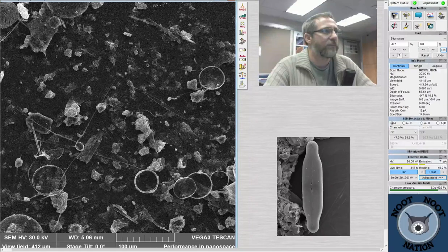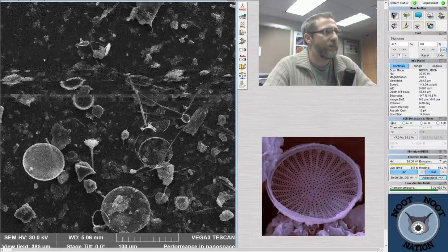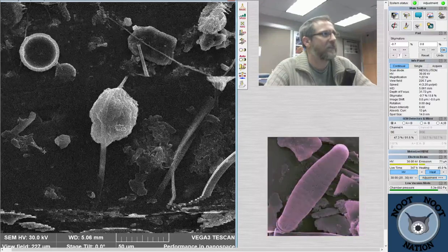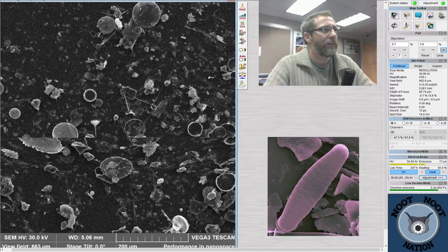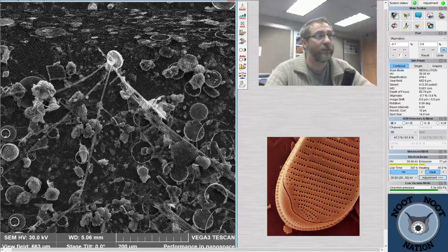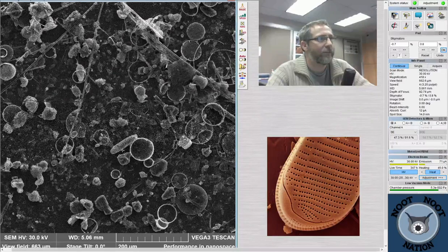So it's encouraging because it tells me there's probably a bunch of skeletonema in here. A piece of junk with a bit of a girdle band on it. It means we just need to look a little bit for something at that scale, and maybe we can find some without the girdle band on it. That would be a nice thing to finish up our imaging with today.